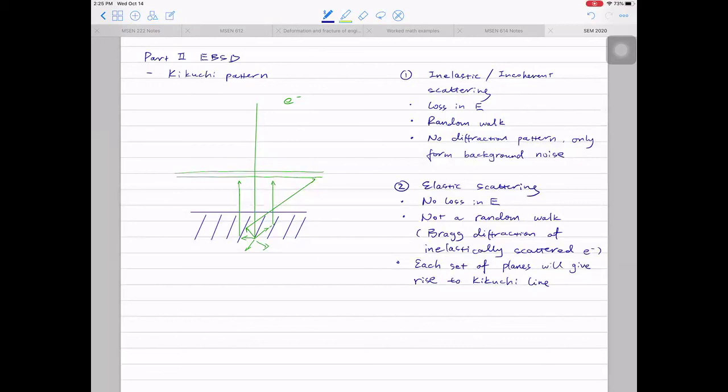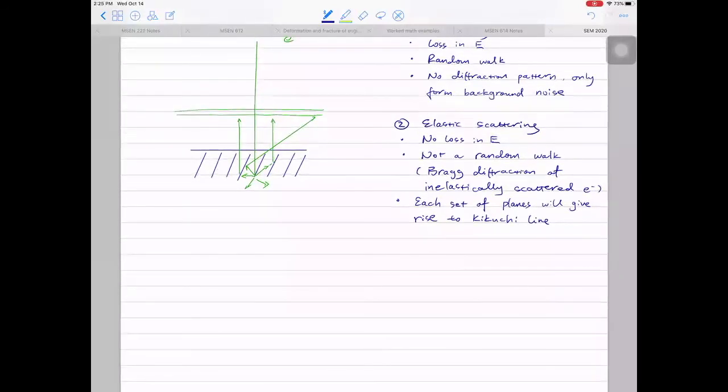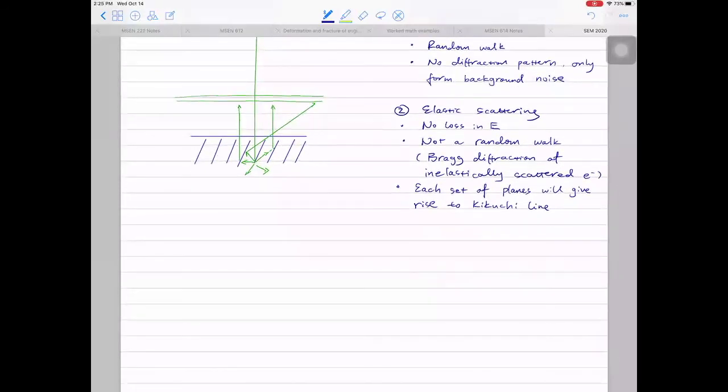Okay. So let's look at what we're going to see in the Kikuchi diffraction. Let's just use the cubic structure as a model. If we look at the 100 set of planes, and we have the detector here. It's bad, it should be circular. Okay.